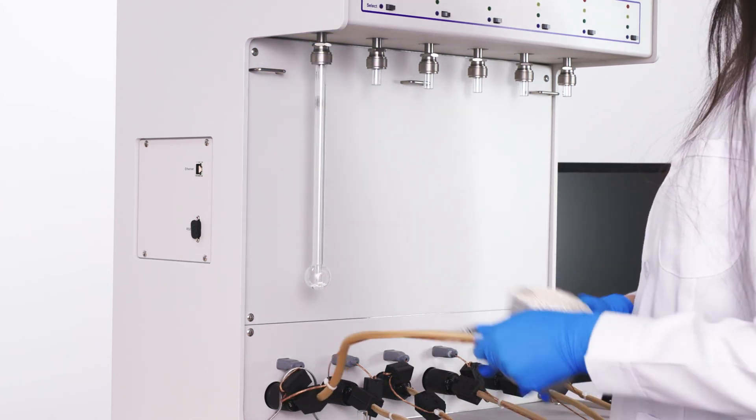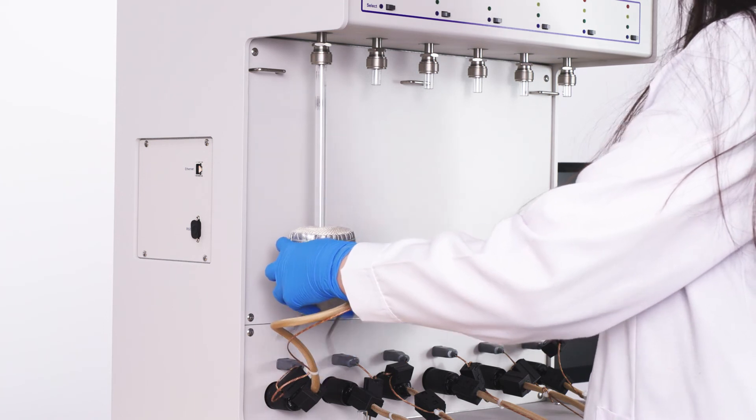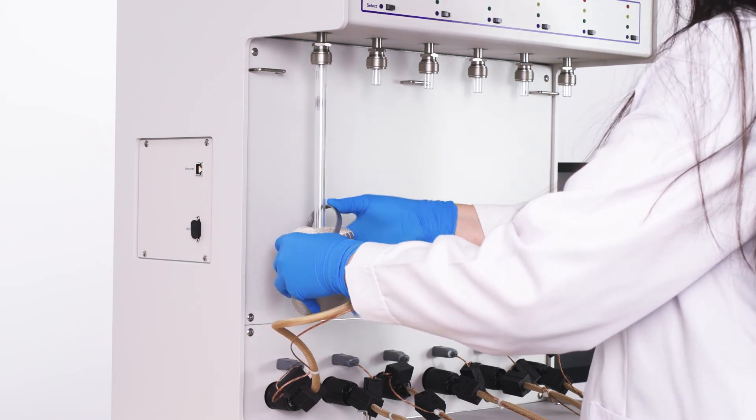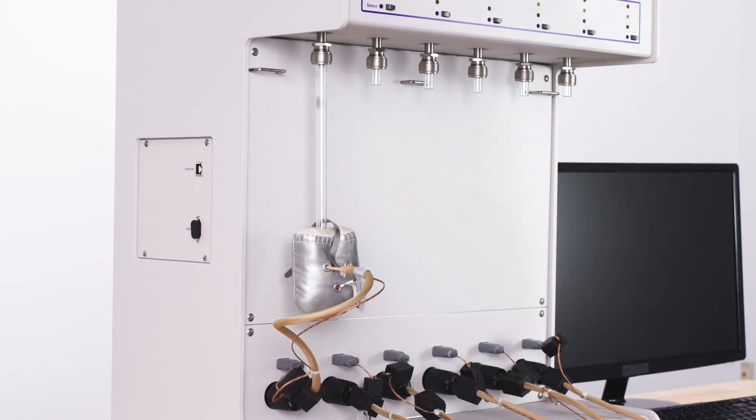Slide the heating mantle over the sample and use the provided clip to hold it in place. The remainder of this process is done using the MicroActive software.